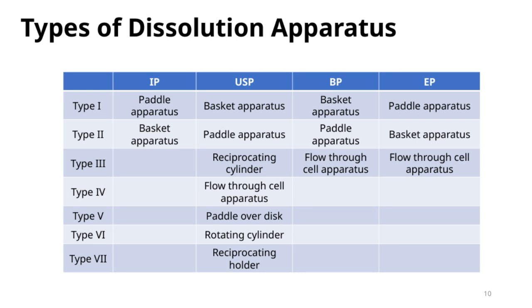Overall, this table illustrates the diversity of apparatuses available, each suited to different formulation types and testing standards. Understanding these differences is crucial for selecting the appropriate method for accurate dissolution testing.